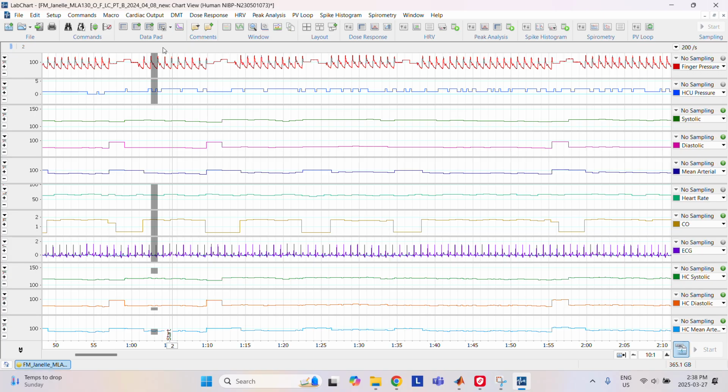And what this is doing is making sure that the peaks are all detected. Sometimes it doesn't get detected, and you have to change the threshold, and I'll show you how to do that in a little while. Usually the threshold that I use is 5%.